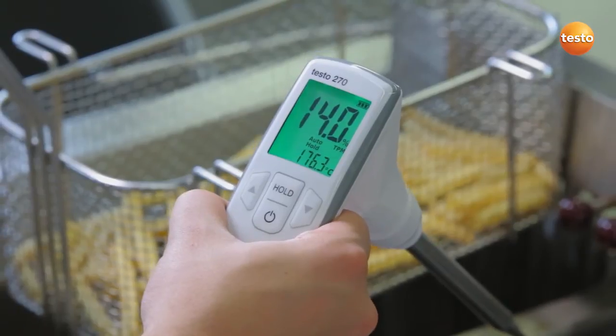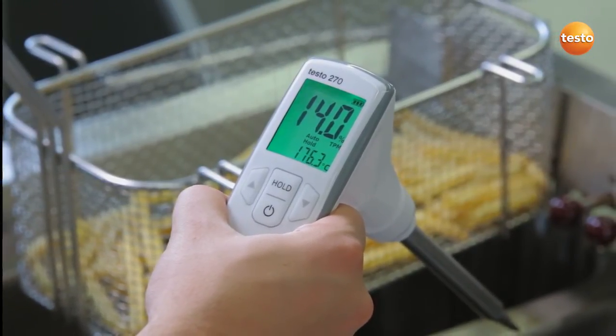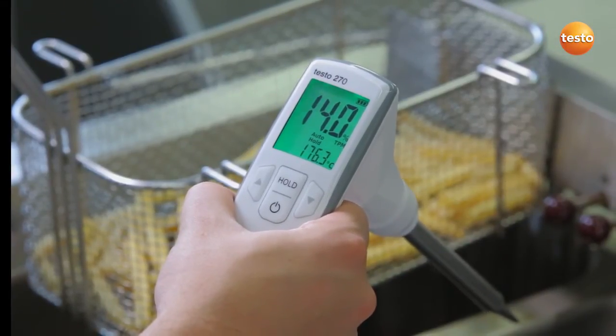This percentage is interpreted by the backlighting of the display in traffic light colors. In our case, the display is green. Our TPM value is 14%, so everything's okay. I could now carry on with more measurements without any problems.